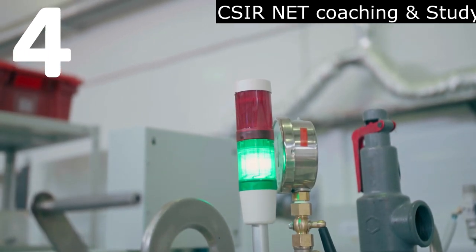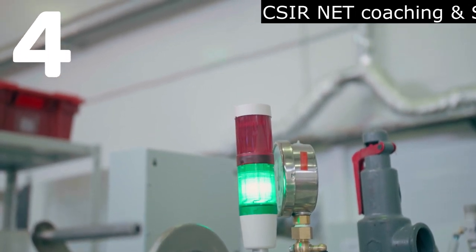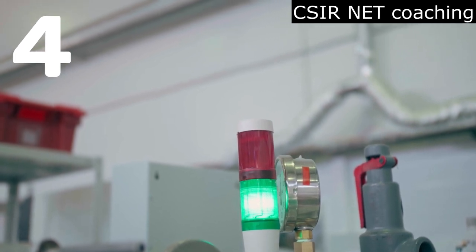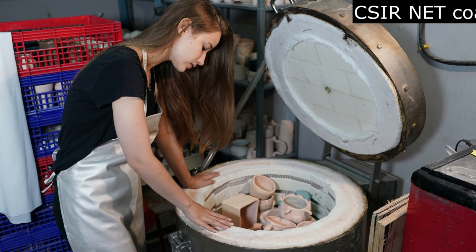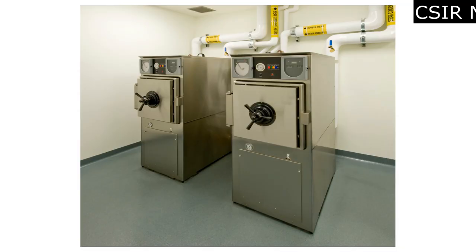Step 4 is monitoring the sterilization process. It's very important to monitor the sterilization process to ensure it is working correctly. Some autoclaves have built-in indicators that will show you when the sterilization process is complete. Others require manual monitoring where you will need to check the temperature and pressure gauge periodically.